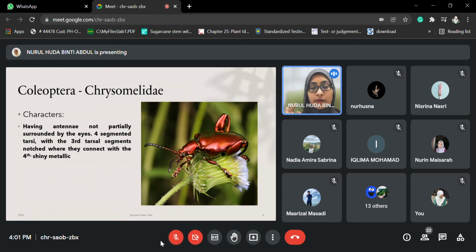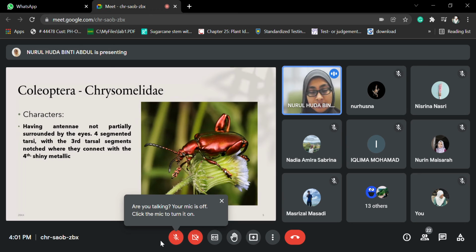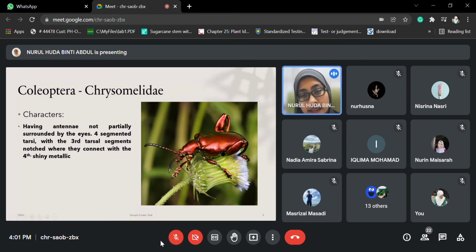But for this guy punya karakteristik, sebenarnya under microscope you can see there is some sort of macam a bit separation. Dia tak nampak clear macam 3 segmen ni. Yang ni kamu boleh nampak obviously kan, kamu cabut 1 and then another 2 tinggal. Okay, but it's actually 4. Cuma ni yang 4 tu dia actually combine dengan yang third, yang betul lah yang third tu. So yang 4 tu tak nampak.